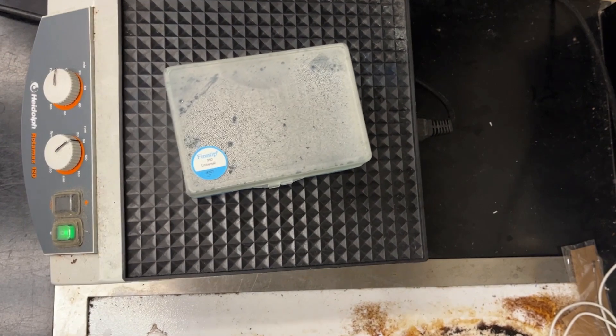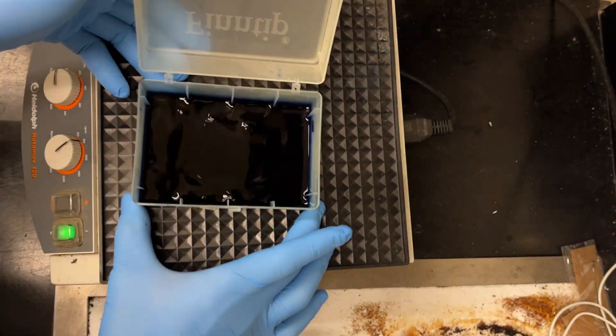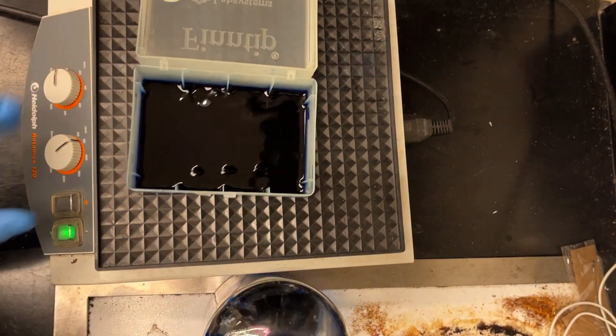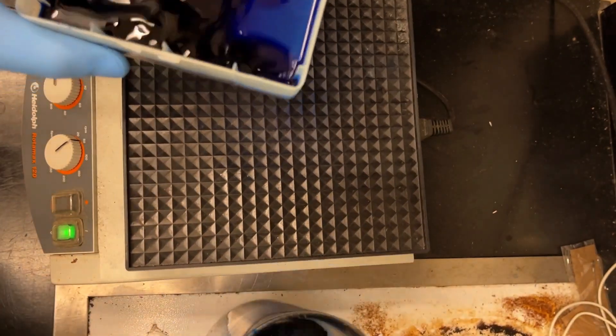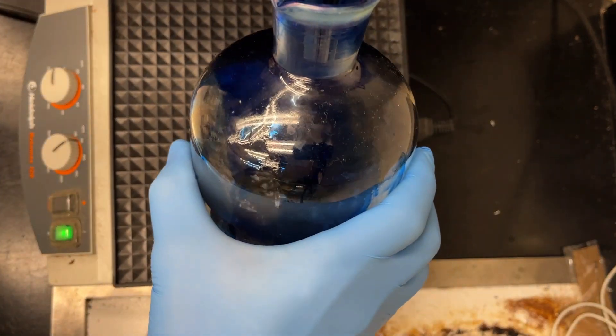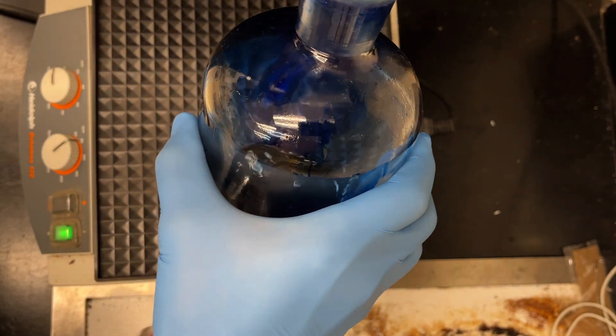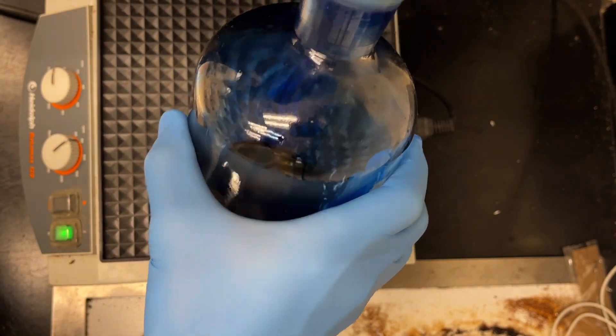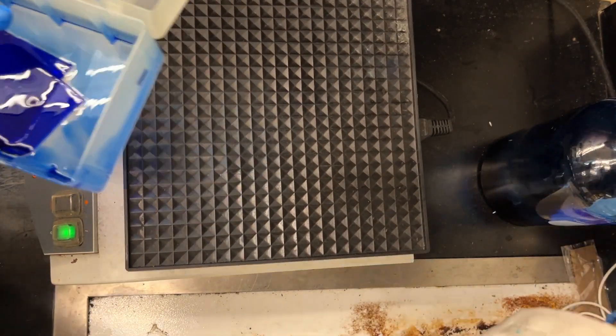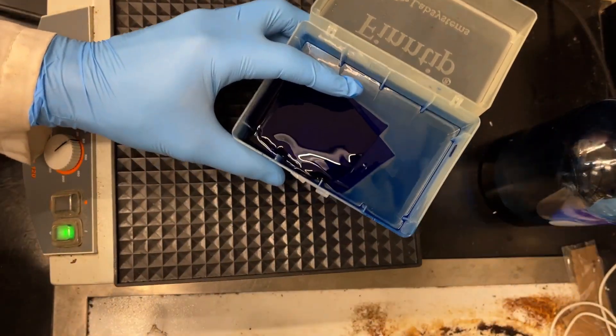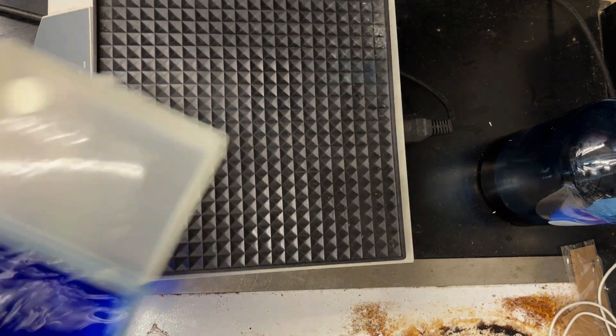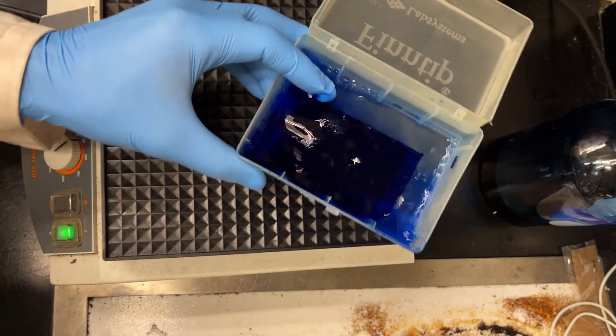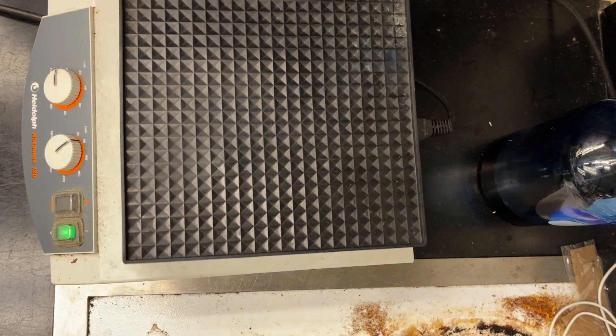And it's now the morning. So we can save the Coomassie. You simply pour it into your container. Remember, use your finger, hold down the gels, and then simply pour it off. Now, the thing about staining with Coomassie is that it stains everything initially, so we actually have to decolorize the gels. But before I do that, I like to just remove some of the excess Coomassie. So just a couple of rinses of distilled water.